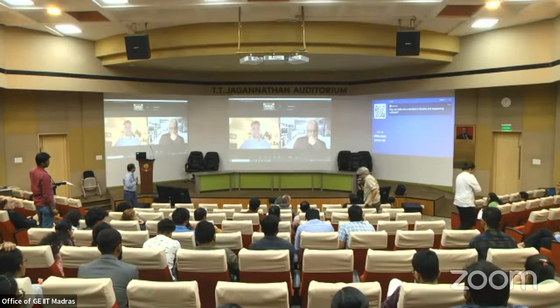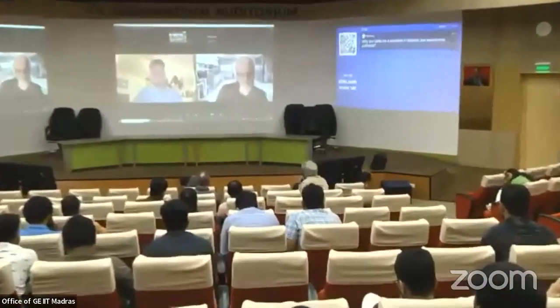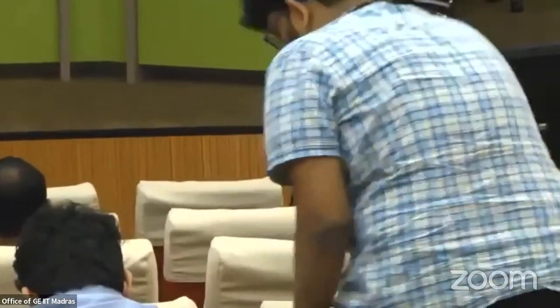Hi, Stephen. Great talk. I'm wondering if you can comment on some of the new sequencing platforms that are coming out, particularly from PacBio, that are promising much higher quality, and the implications that will have for your deep sequencing method.